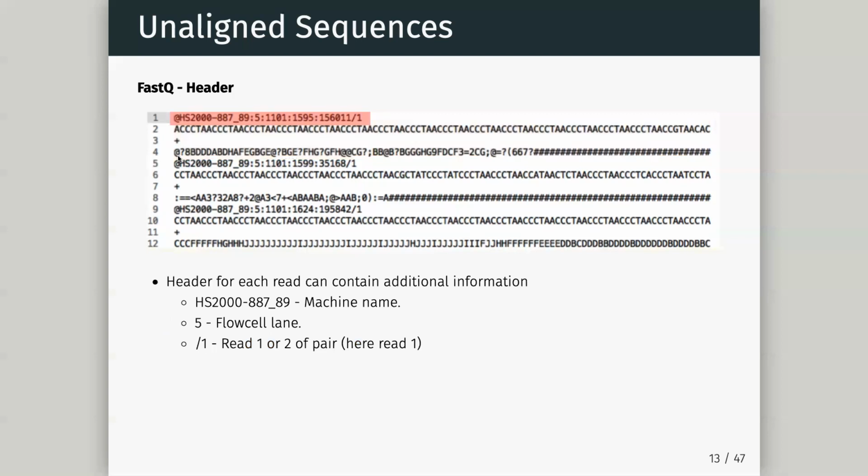The first useful line, and it's going to save your project occasionally, is the header line, right? Because this tells you whether you've messed up anything or got the wrong fastq. It tells you the machine you were sequencing on. And actually, this last bit of it here is also unique to your run. So this machine name tells you I sequenced on a particular machine in the world. So you know this fastq came from our genomics center by matching up this header. You can actually tell how it was sequenced.